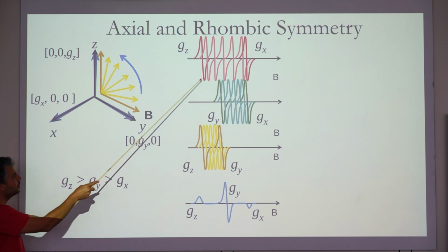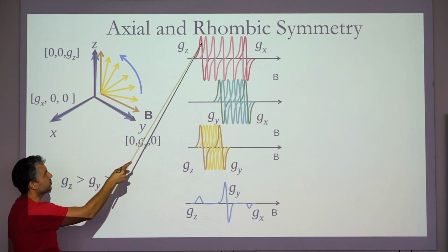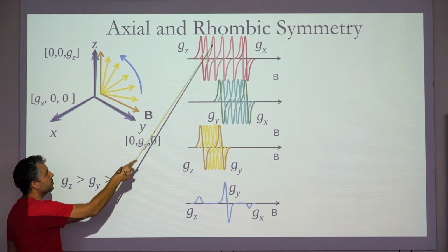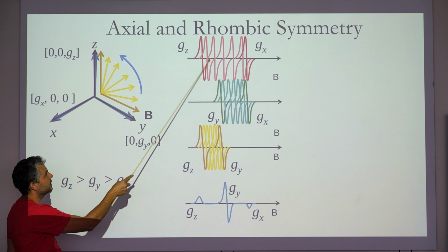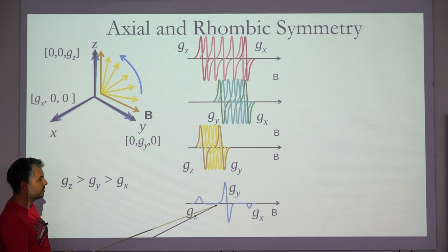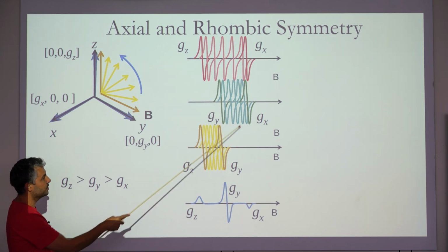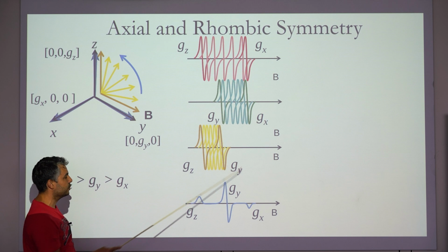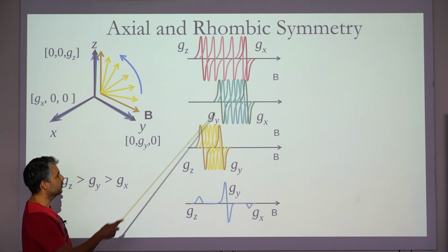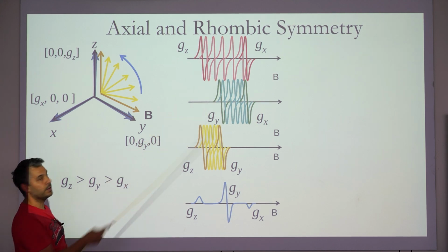So then you can see that where this value occurs, all the values in between start to slightly cancel. The positive part of this resonance cancels with the negative part of the previous one. So you have zero like here, and then the same but in the opposite direction for the GX direction. In between, because you have the GY value, it is repeated in several of the planes.